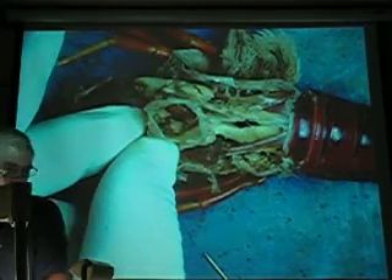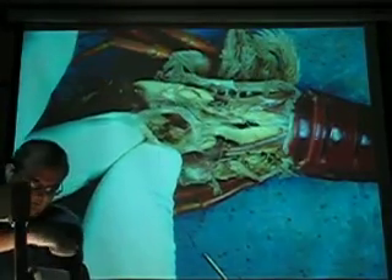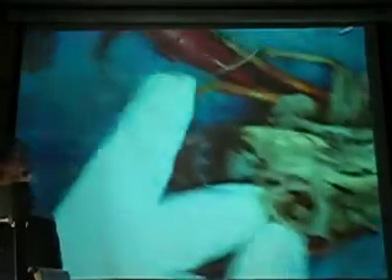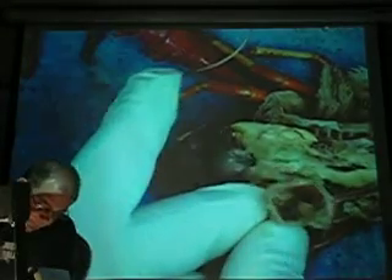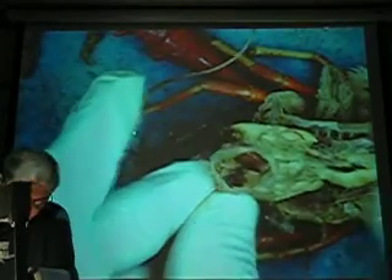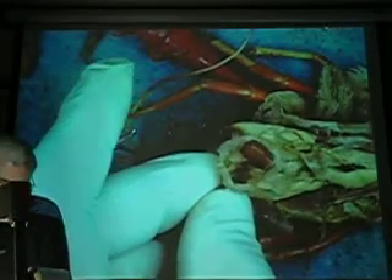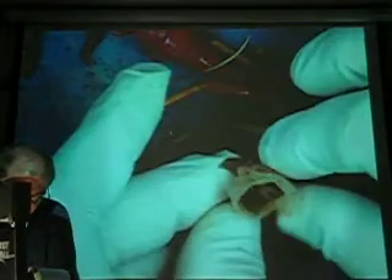This will be cool. Oh, this is the top. Let's see if we can remove these shadows — that could crop the whole apparatus. Let's go here. Can we see it to there? I can. See those black things down there? So far there. Yeah, it's the gastric teeth. All gastric mills have been kept intact by the section.